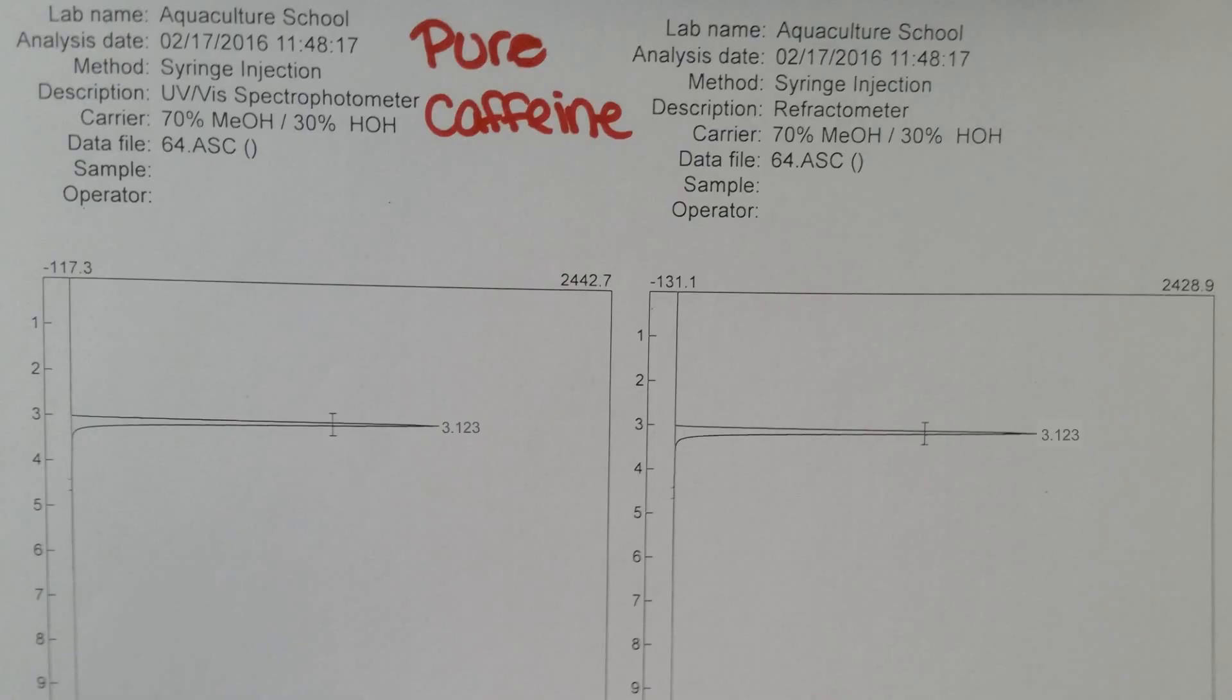To identify this was indeed the caffeine, a pure sample of caffeine was run. The single peak occurred at 3.123. Although this is a little bit different than the ones we ran, we can successfully identify that it was caffeine in the other samples.